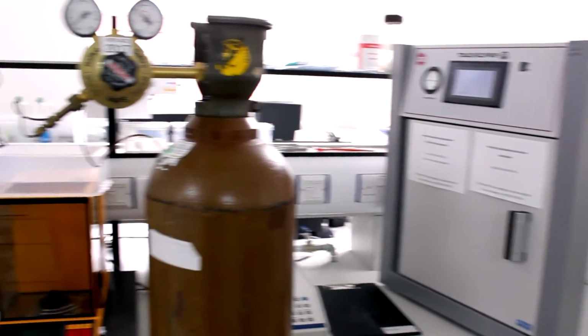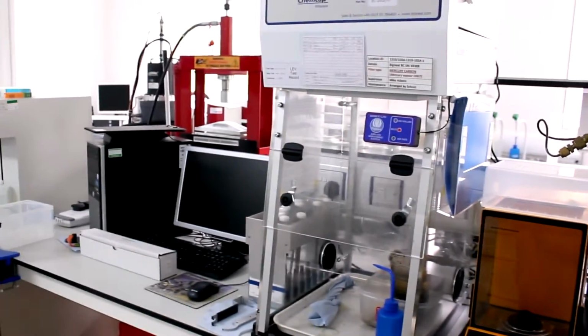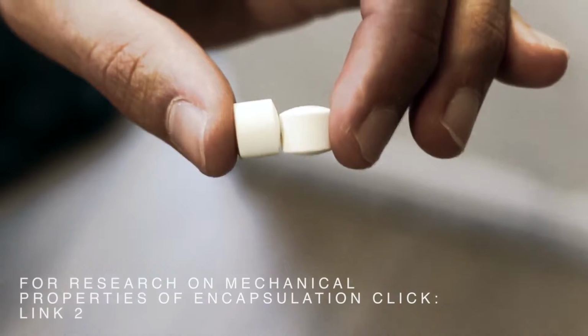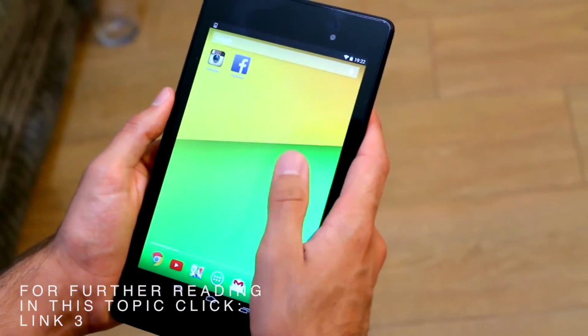The equipment I maintain and work with helps to characterise systems that would be useful to industrial applications. For example, understanding the mechanical properties of encapsulated materials when they're formulated into a tablet. Furthermore, understanding touch and sensory properties of perhaps a smartphone surface would require detailed characterization of the mechanical properties and surface topography of the smartphone screen.